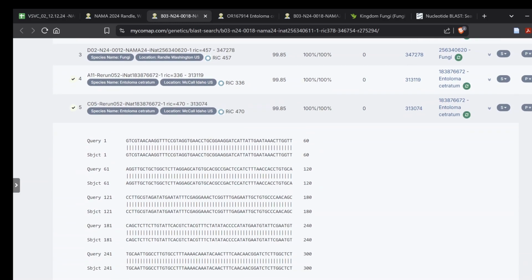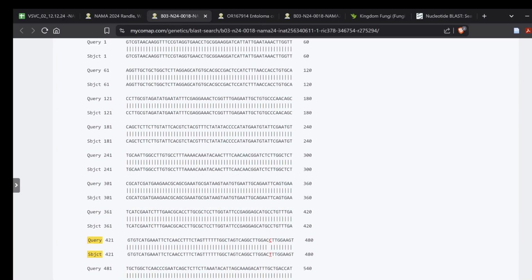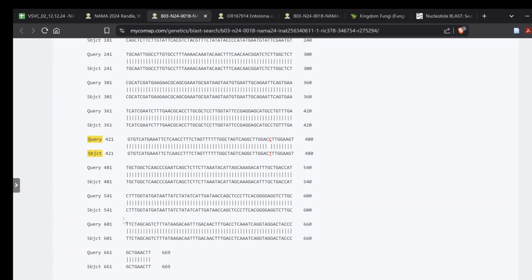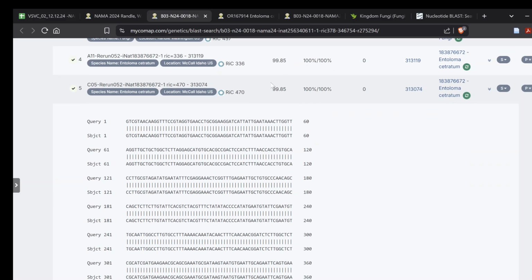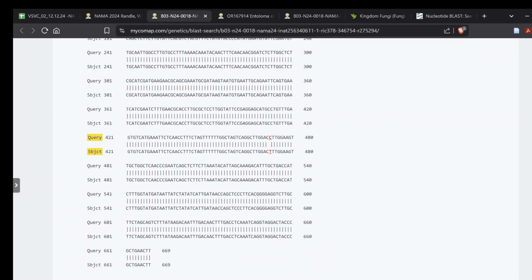Some taxa have ITS sequences that are 450 base pairs, and some have 1200 base pair sequences. So this number means a different thing depending on how long your sequence is. The average length is somewhere between 650 and 700, which happens more often than not, but what's more important is what the actual differences are, where they are, and that kind of thing.